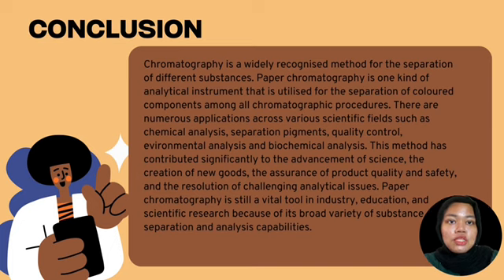With its ability to separate and analyze a wide range of substances, paper chromatography continues to be an invaluable tool in scientific research, industry, and education.